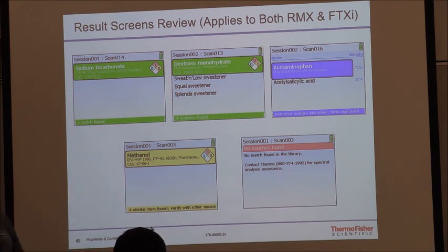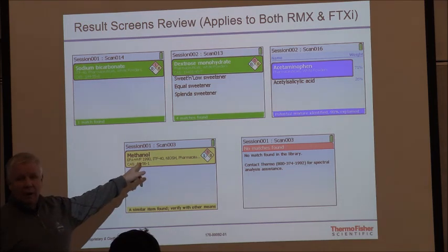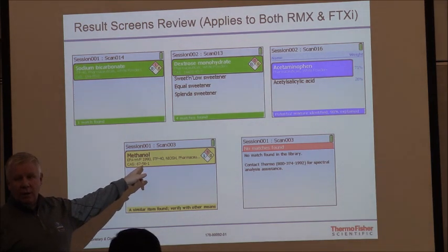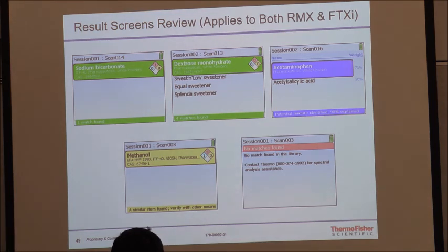Then I can go back and look under PID, what lamp do you use, 10.6? So you look at that, methyl alcohol has an IP of 10.84. Are you going to see it on your lamp? No. But again, that's another example of how, if this is truly methyl alcohol, my PID better not be going crazy. So I'm using a device outside where it was designed, but I'm using its capabilities to help me with that. So I can get all that basic information.